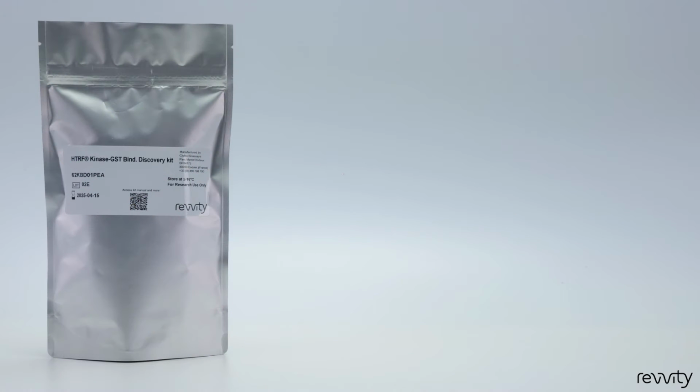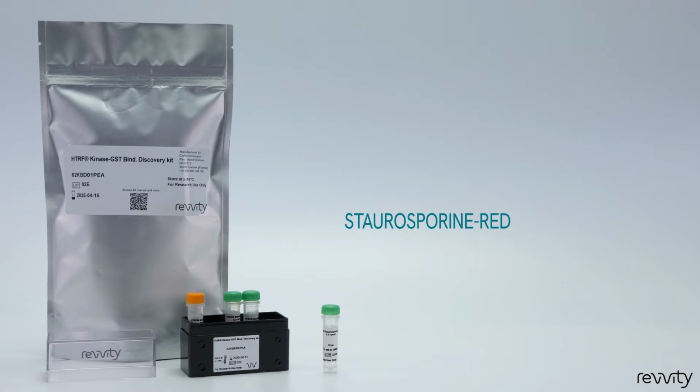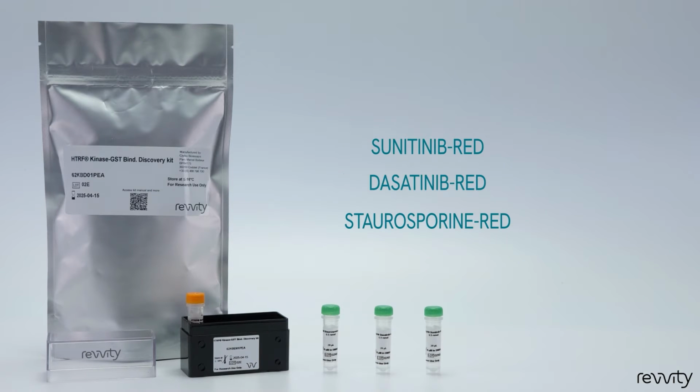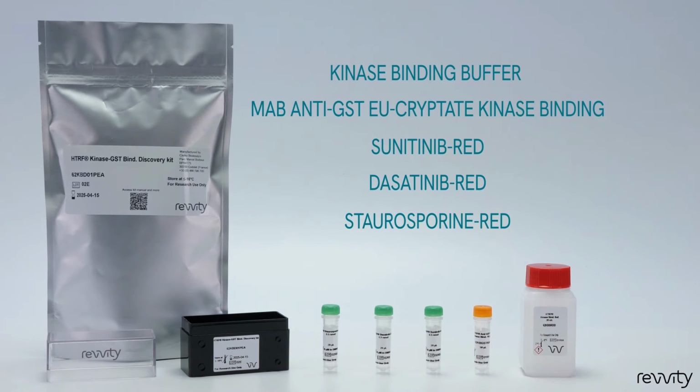Let us show you how to proceed with the Kinase GST binding discovery kit. The kit includes 3 D2 labeled inhibitors, staurosporine red, dasatinib red, and sunitinib red, monoclonal antibody, anti-GST europium cryptate kinase binding, and kinase binding buffer.